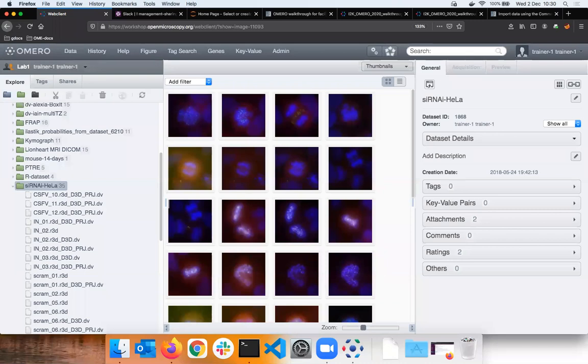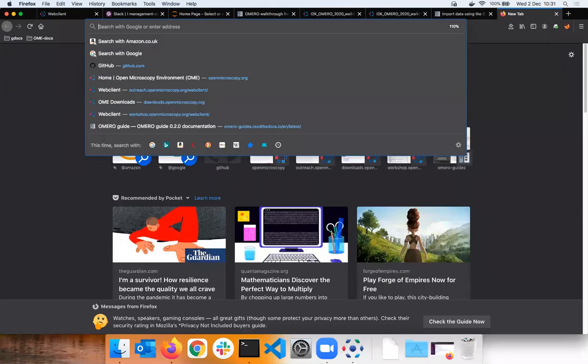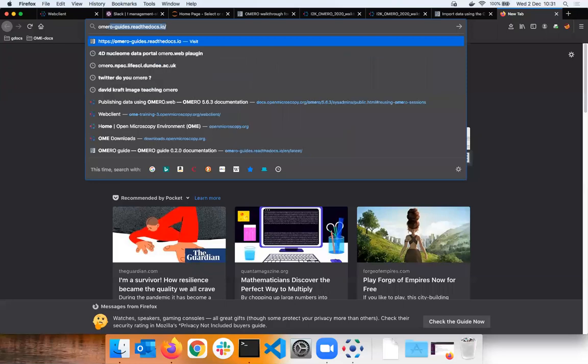Yes, so I think in that case you're more in something we have called Dropbox. That's on the OMERO server already, so it's not an in-place import. That would mean running Dropbox in a different location, because we have something called OMERO Dropbox, where as soon as the data go into that box, that container, they get imported automatically. It's not a Dropbox for real. It can be any location.